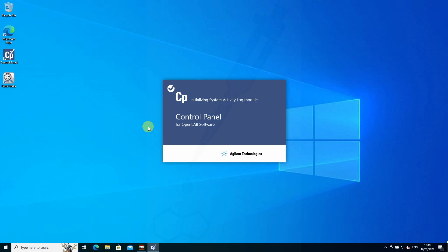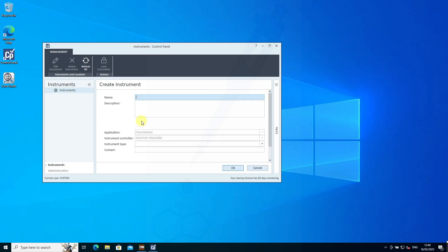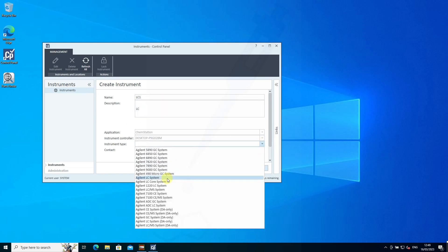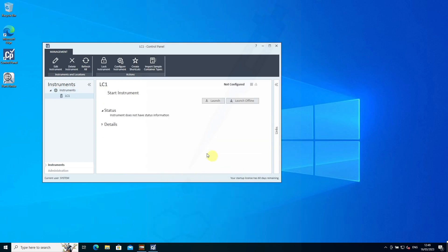In here, we need to configure our instrument that's running in the background. We'll create a new instrument, call it LC1, give it a description, ensure we select the right instrument type, and click OK.